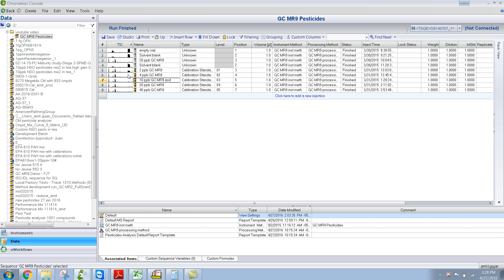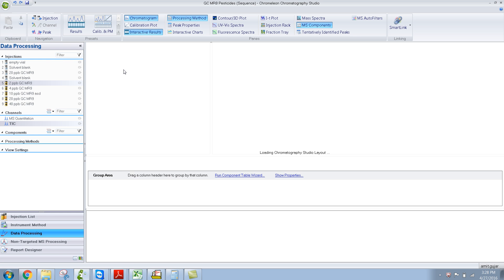The other useful key is the refresh key, which is F5. When I press F5, it refreshes the chromatogram — basically refreshes the data. This is useful when you have a sequence running and you want to look at real-time data. You can press F5 and the latest data will pop up in the studio.